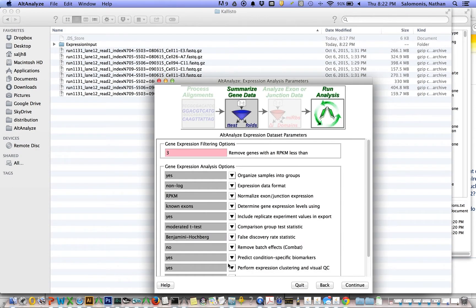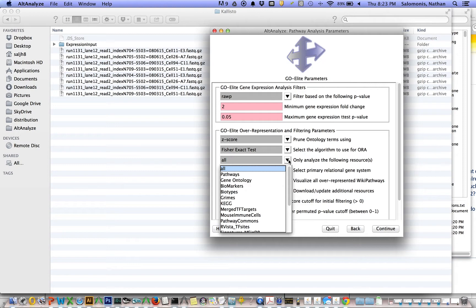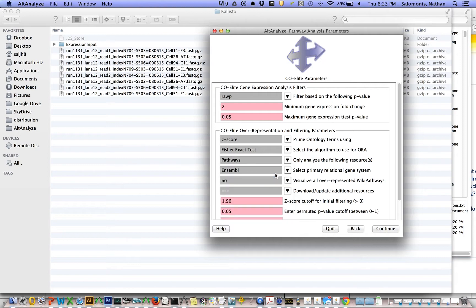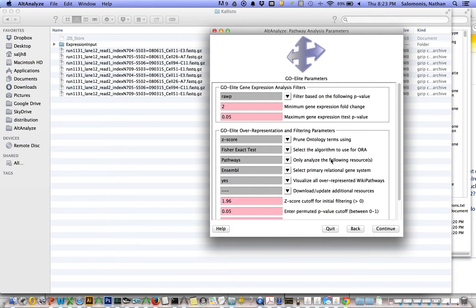You can change a number of these parameters. In previous tutorials we've outlined what some of these parameters mean. Again, you have more parameters. In this case, this is for pathway analysis. For example, we can say let's just look at pathways and view those pathways too as wiki pathways, colored wiki pathways.